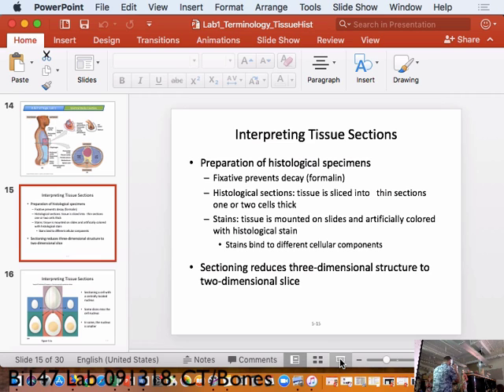And you want to get it so that the images coming through both tubes merge into one and aren't some kind of jumbled two images. Okay? So you're checking it out under the 10X, and you can move around using that bar that I showed you, that's on the side.